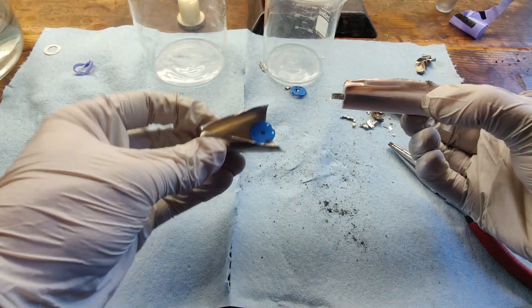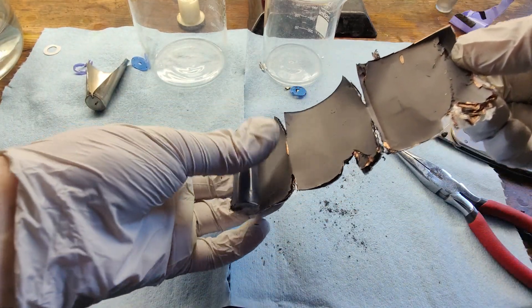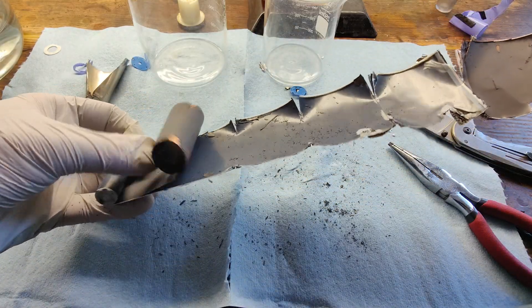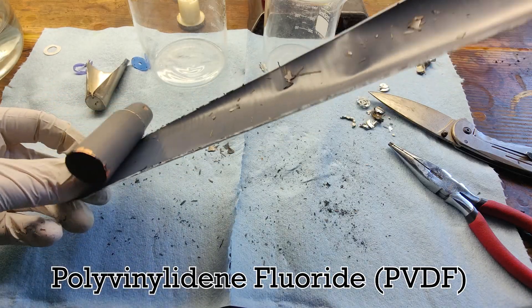In order for this technique to work, the aluminum must first be separated from the oxides prior to dissolving them in the acid. Unfortunately, the metal oxide layer is often bound to the cathode by a strong, chemically-resistant adhesive. While the adhesives can vary, I figured that the most likely candidate was polyvinylidene fluoride, or PVDF.